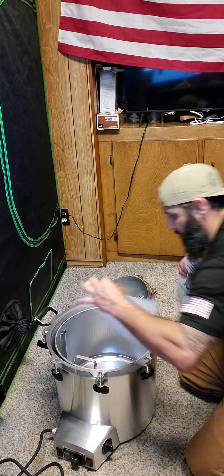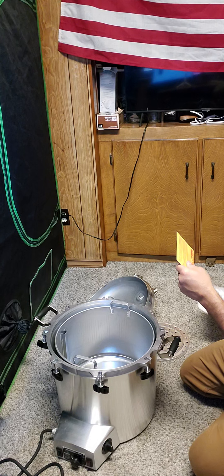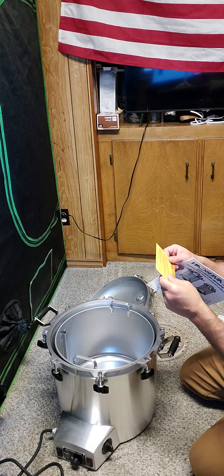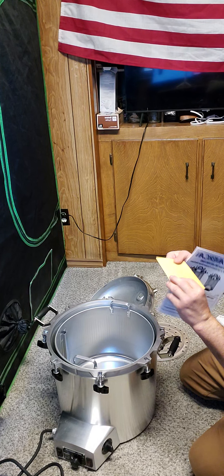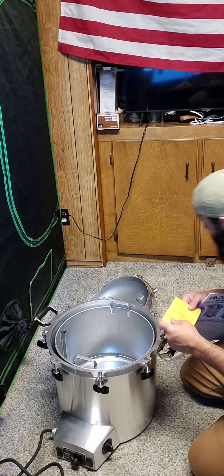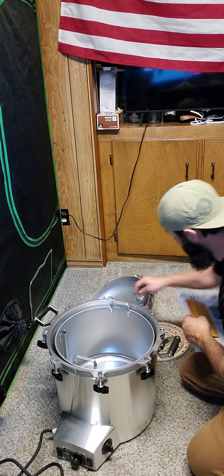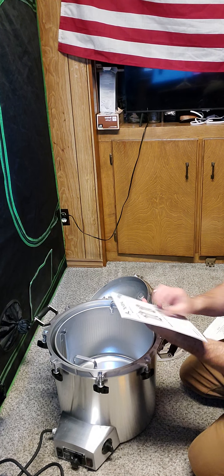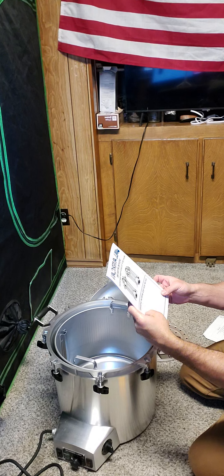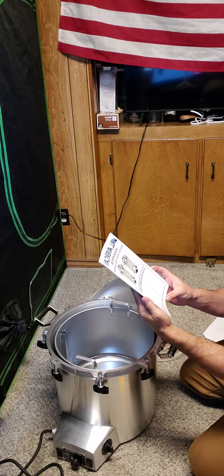Got our instructions. Overpressure plug — this is a spare, spare overpressure plug. Having French and English, probably Spanish too — the international trade language French.